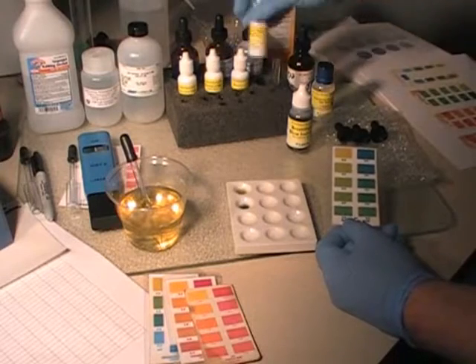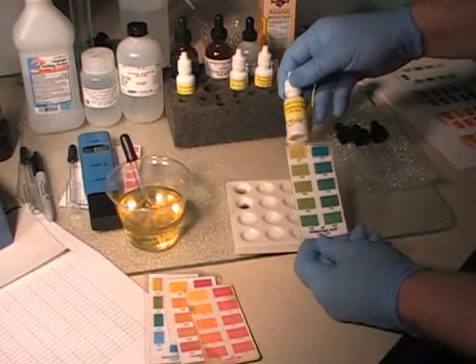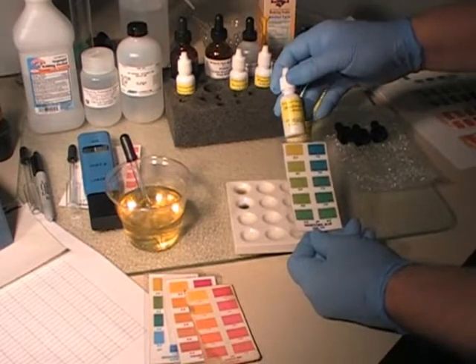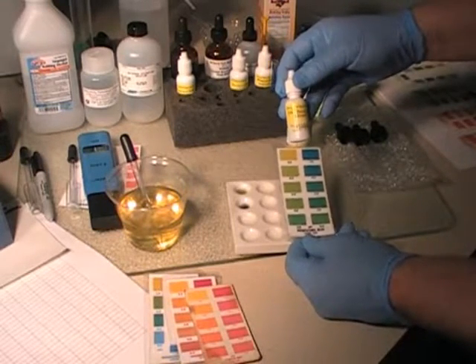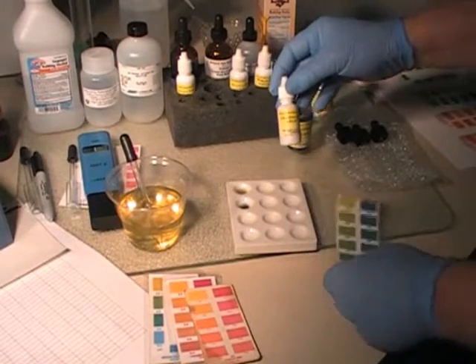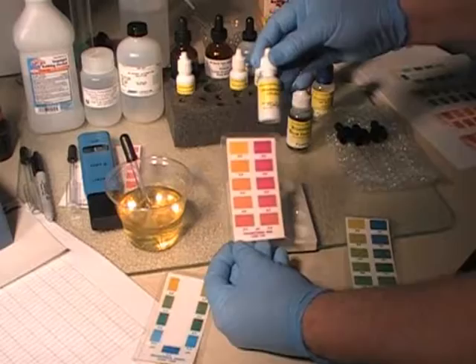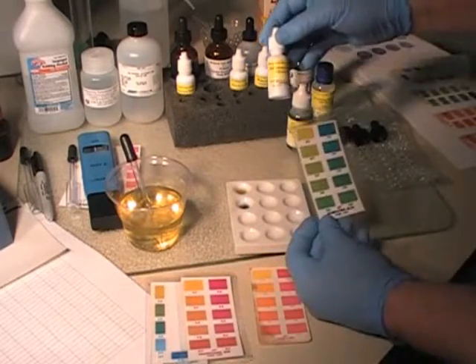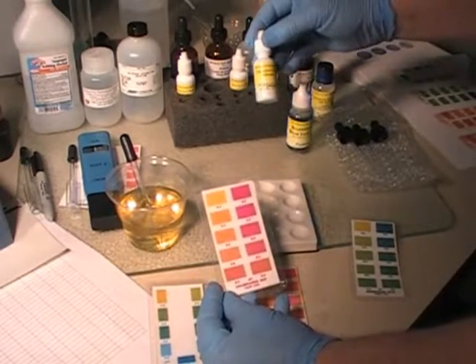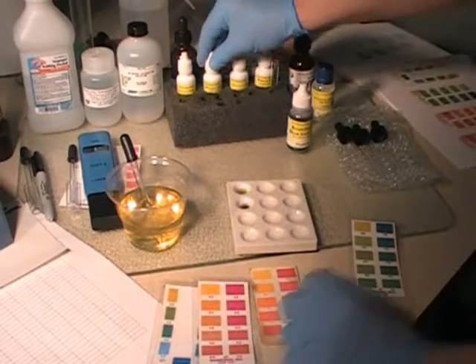We're not going to have to go to the chlorophenol red to verify whether it is less than a 6.0 or not, because we can see that it's not. If, for example, the color was a yellow, then that's what we would use the next well plate for. We'd put a chlorophenol red drop in there, because your chlorophenol red covers from 6.8 to 5.2, where your bromthymol only covers from 7.6 to 6.0. So this is a cross check, and it is used to figure out what the pH actually is if it's too low for the bromthymol blue. But in this case it wasn't.